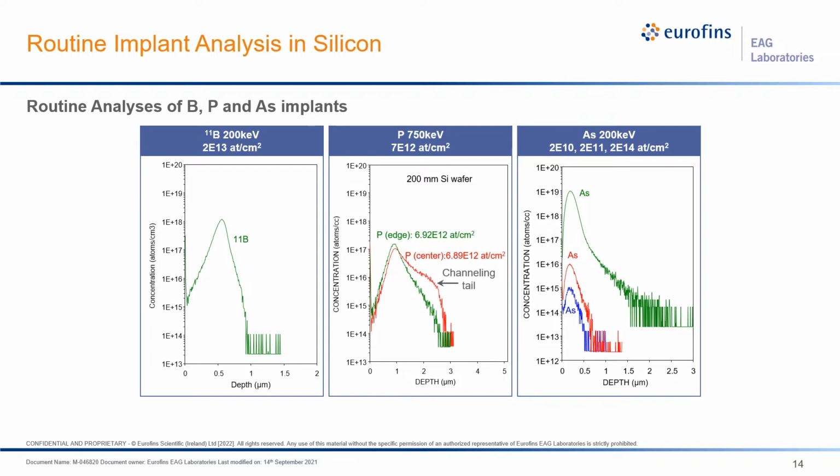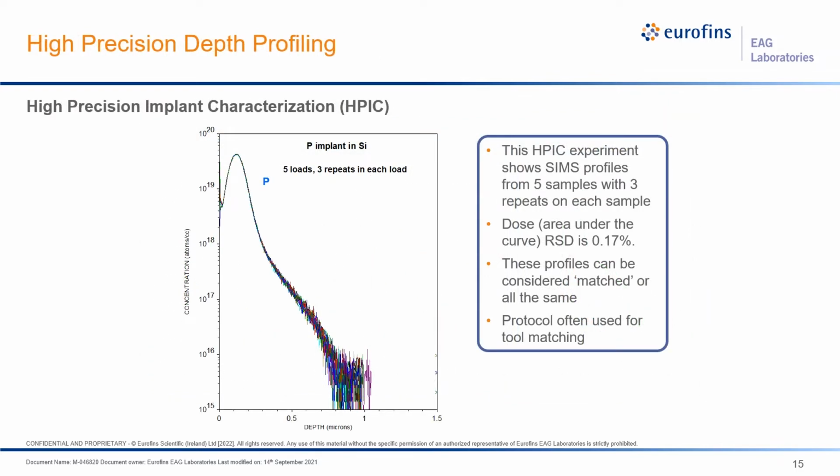SIMS is also used for tool matching, or looking at how your instrument is processing ion implants over time.